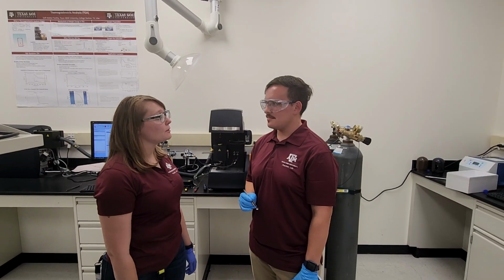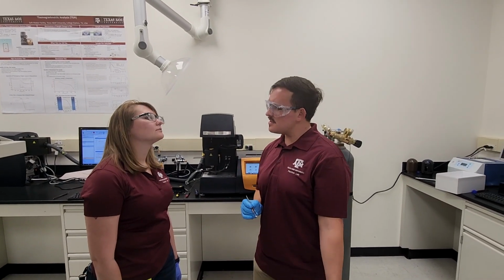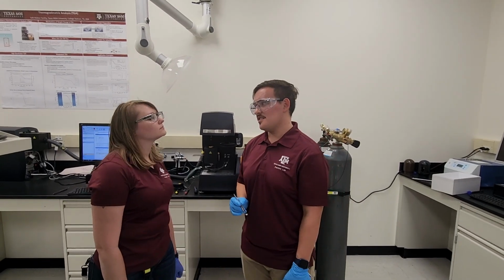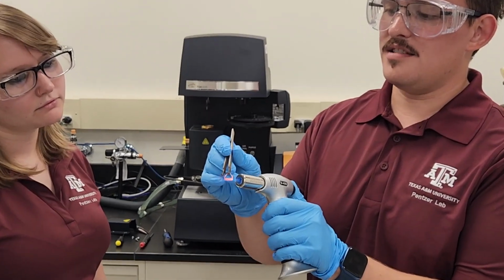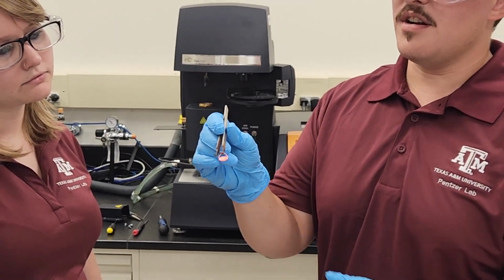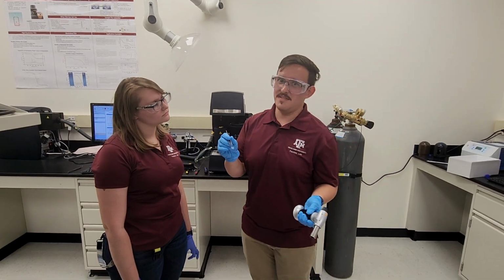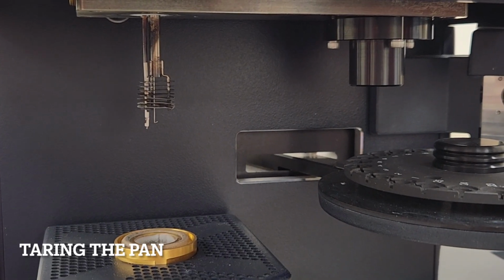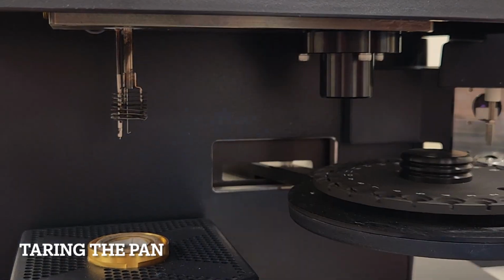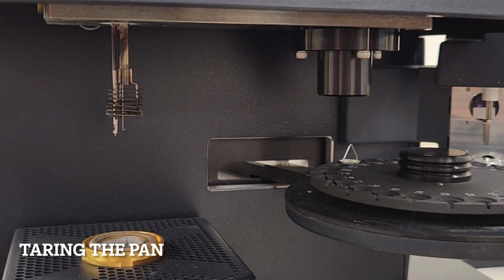So now we can load our sample, right? Not quite. It's always good practice to clean your TGA pan, and so we utilize a flame torch until it's bright red, like so. Make sure you don't bend the platinum because it is soft. And then after it's cooled, you can tare it. Most TGAs use a platinum hook. Don't touch it, because it can easily bend and ruin the data.